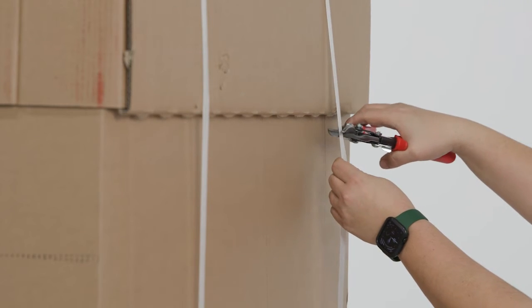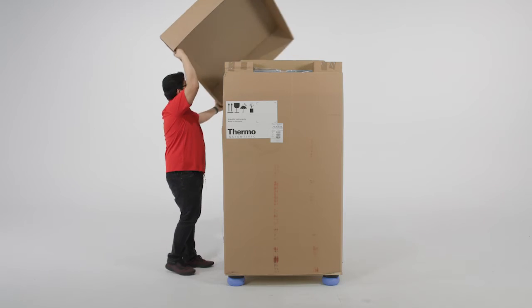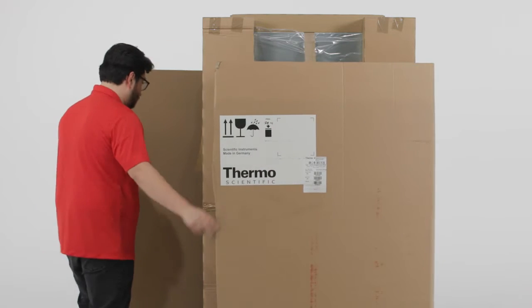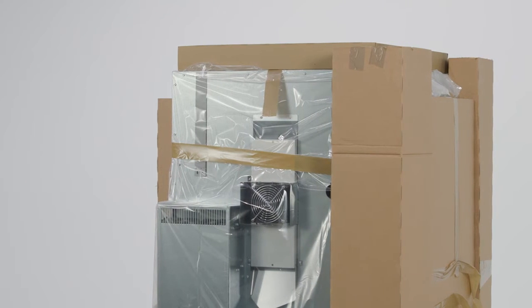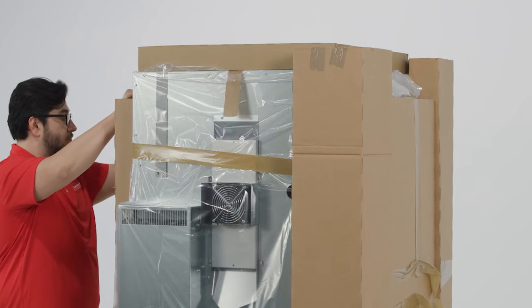Cut the plastic packaging ribbons from the box. Then remove the top cover from the box and place it to the side. Open the cardboard gently by unfolding it from around the unit. Carefully inspect the unit for damage before proceeding. Please do not discard or recycle the cardboard until the unit has been inspected.